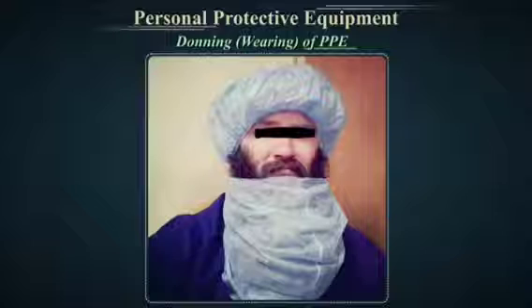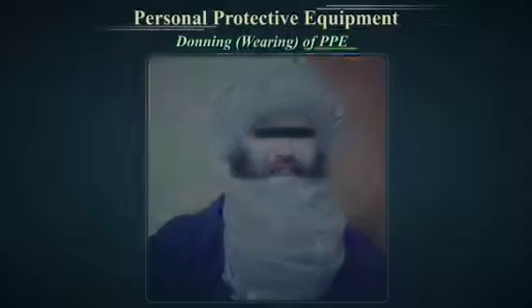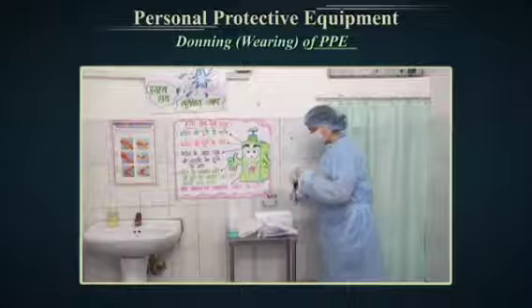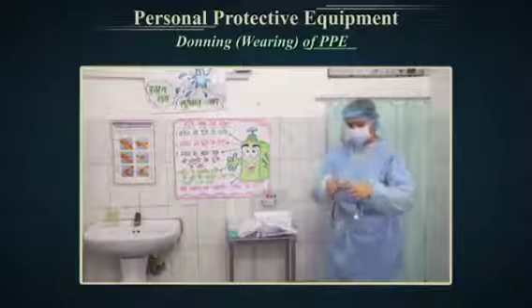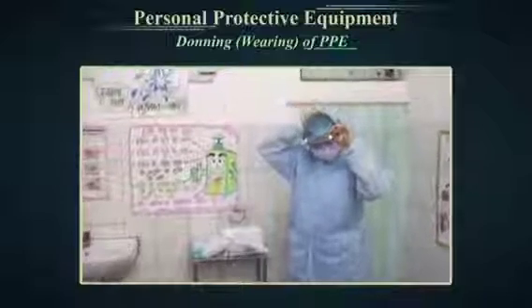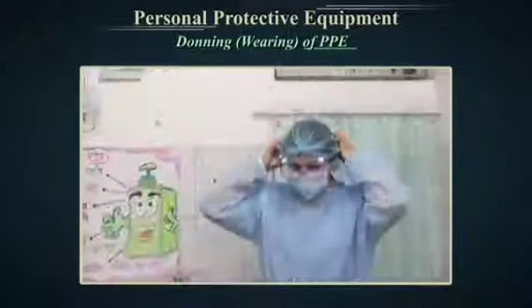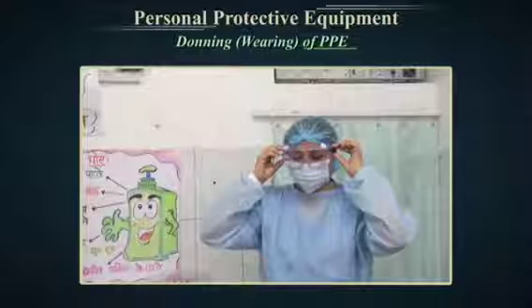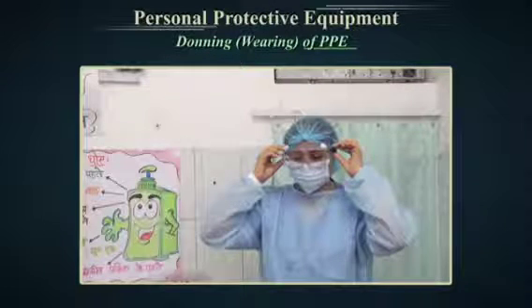Facial hair interrupts the seal, and even a small amount of stubble may compromise the protection from pathogens. If the respirator you selected does not contain eye protection, then a separate eyewear must be worn to protect from splashes or sprays of infectious material. Protective eyewear may be safety glasses or goggles. Many shapes and styles are available.